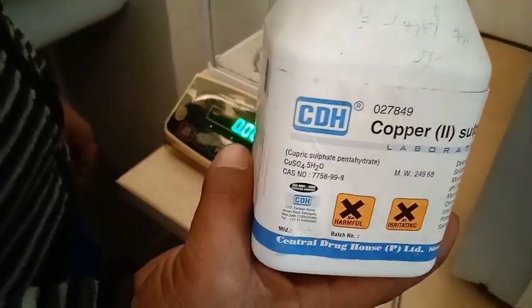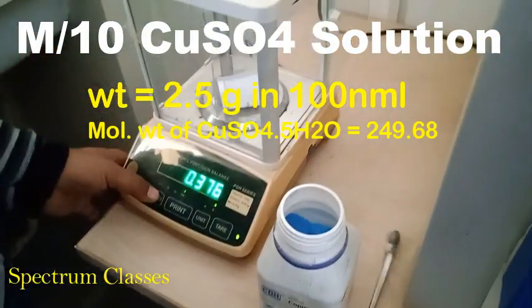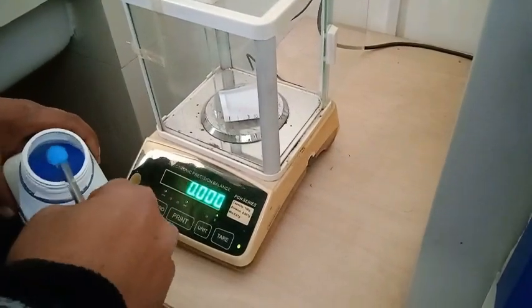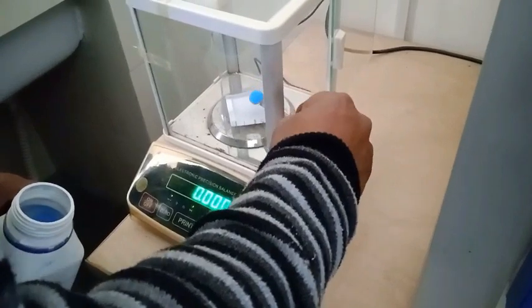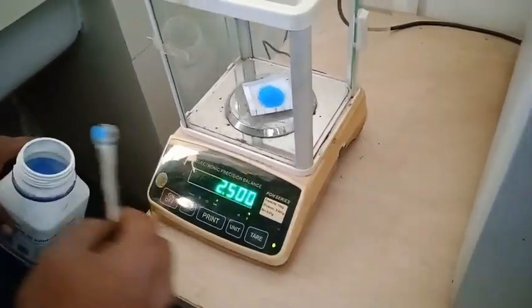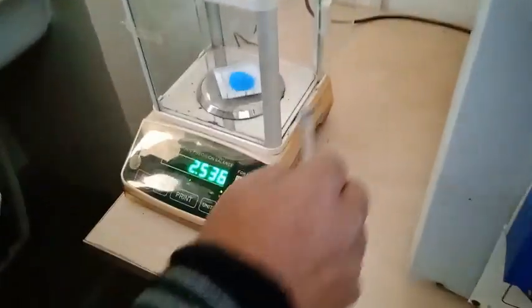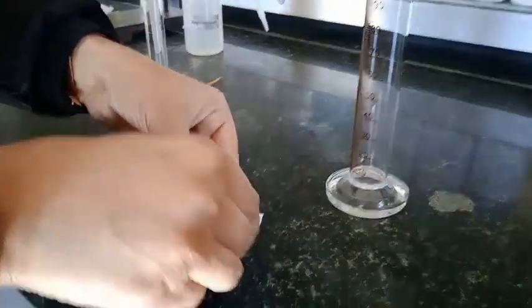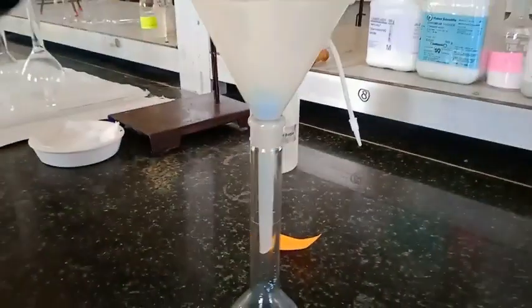I am preparing the solution of copper sulfate. It is pentahydrated copper sulfate and its molecular weight is 249.68 grams per mole. So to prepare 100 ml solution of M/10 concentration, I have taken 2.5 grams of copper sulfate. I am first preparing this copper sulfate solution.